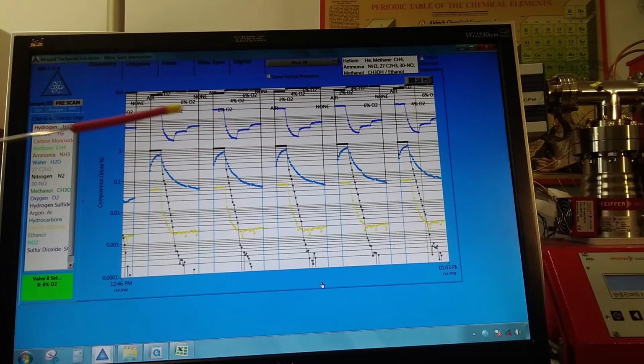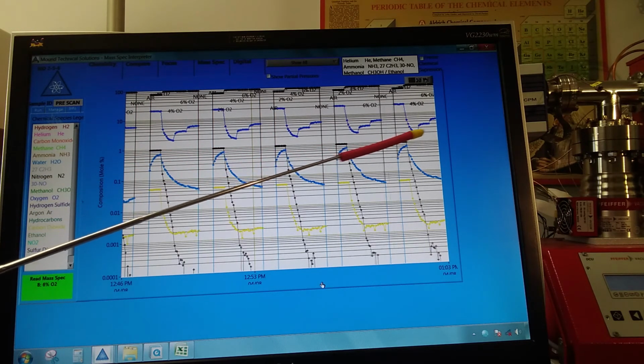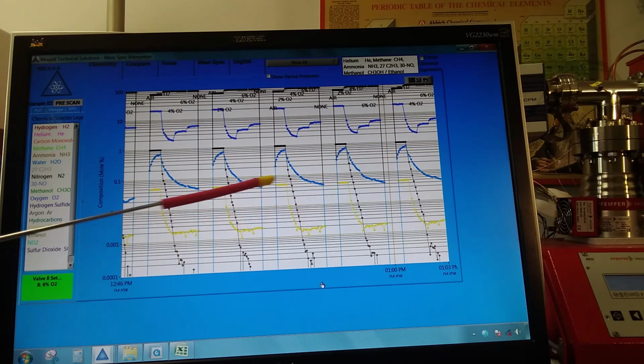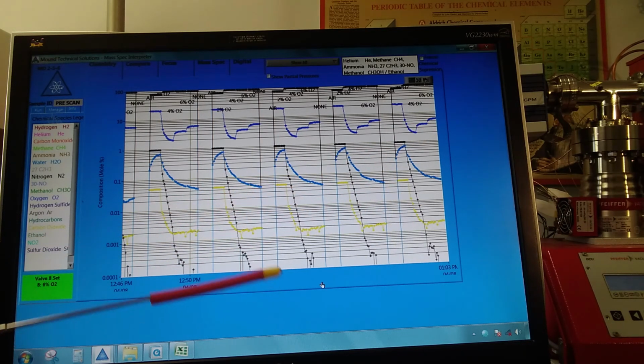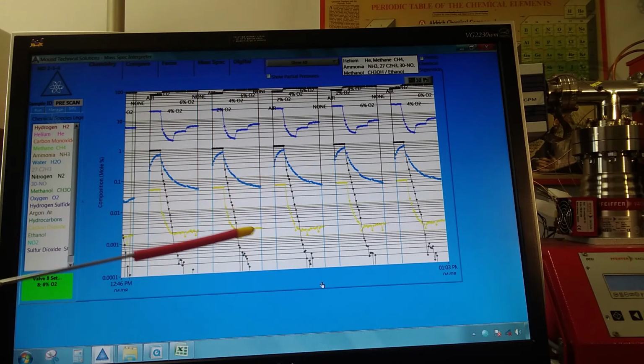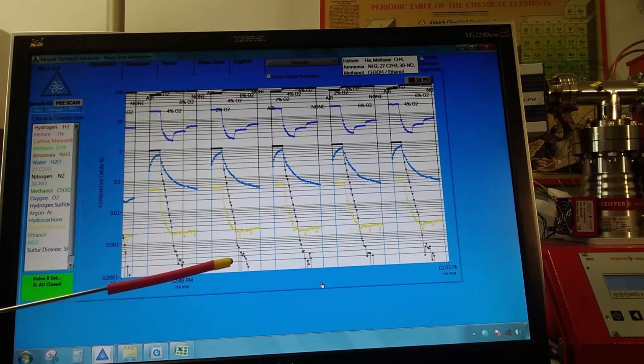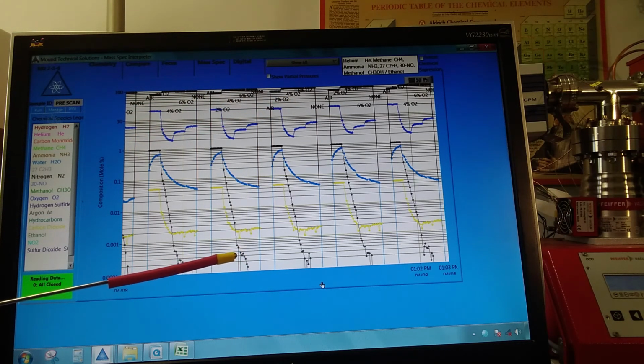We're interested to see that the argon that's present with our room air goes away in our cylinder gas each time. Same thing goes for the carbon dioxide and the water vapor trace. So we've basically got a good foundation for using the mass spec in this application, and we'll just continue to evaluate and test.